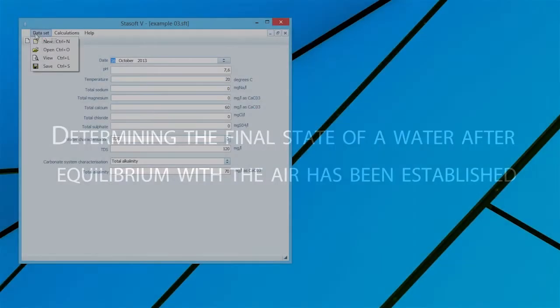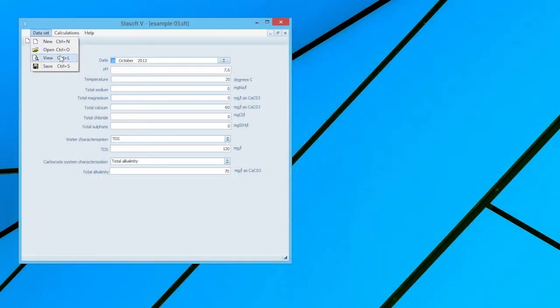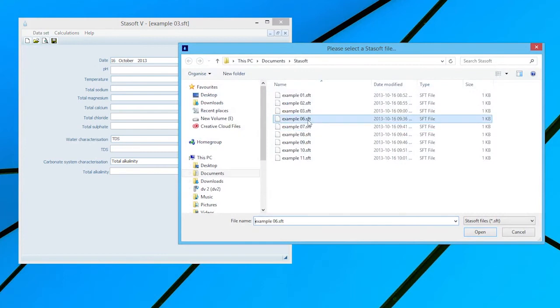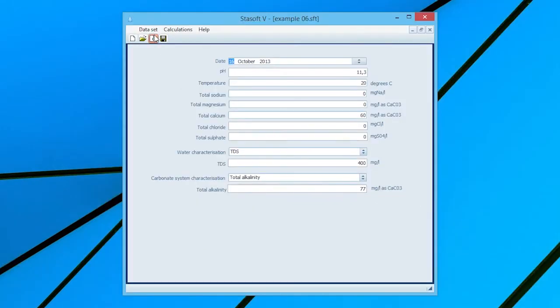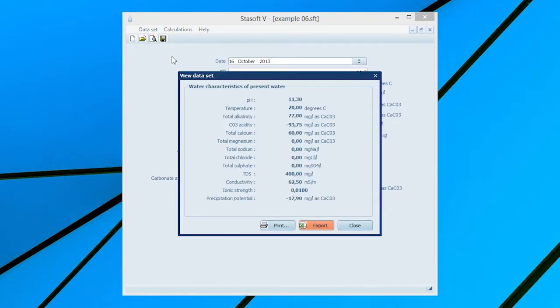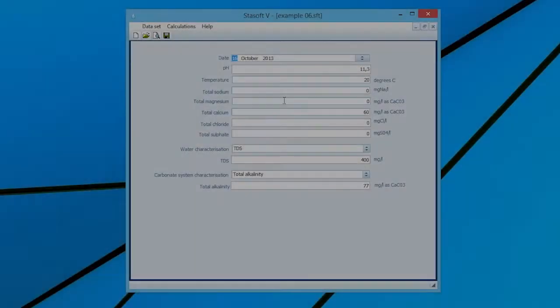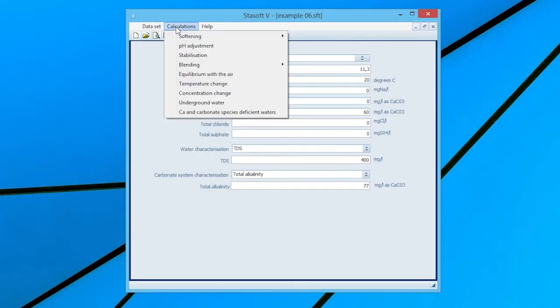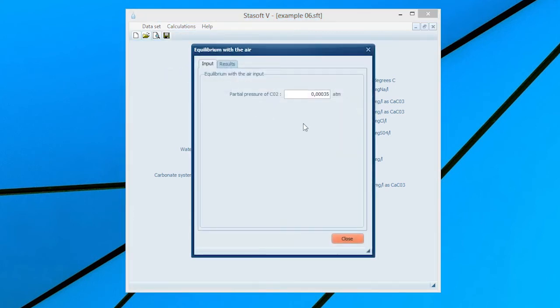Determining the final state of water after equilibrium with the air has been established. Select Dataset 6 for Example 6 in the manual. After entering the data into the Dataset input window, selection of the View option will bring the window displaying the characteristics of the present water onto the screen. Close the window and select the Equilibrium with the Air option from the Calculations menu, bringing up the Equilibrium with the Air input window.